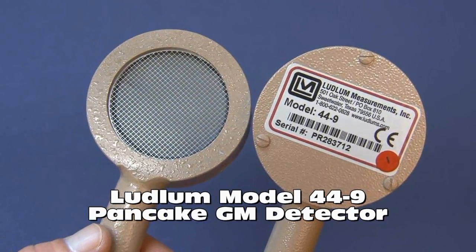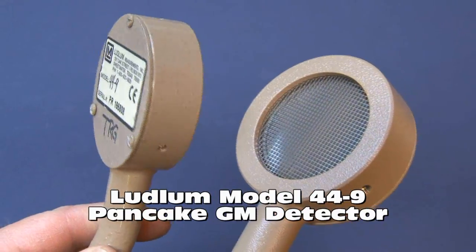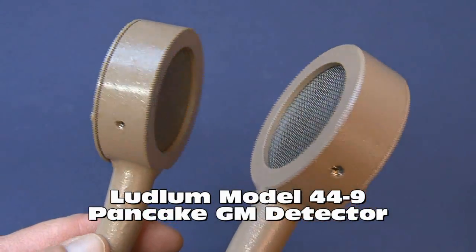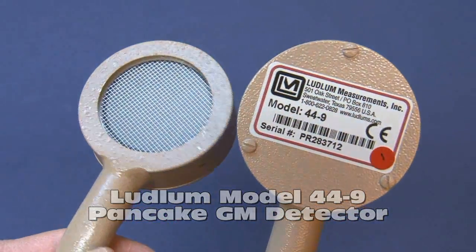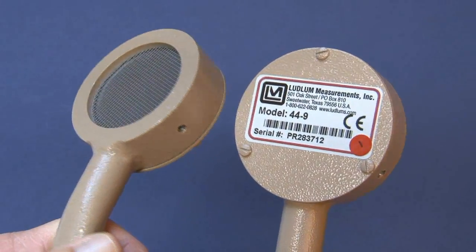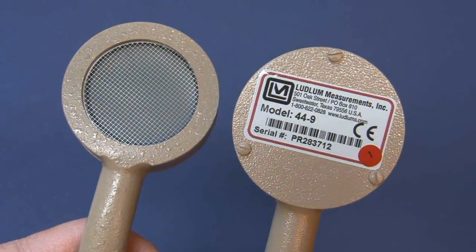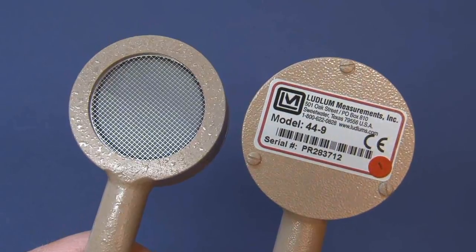I want to talk a little bit about the Ludlum model 44-9 probe. This is a Geiger-Mueller or GM detector and it's capable of detecting alpha, beta, and gamma radiation. A lot of times you'll hear this referred to as a pancake probe or a pancake detector. Sometimes folks will call it a frisker probe as well.